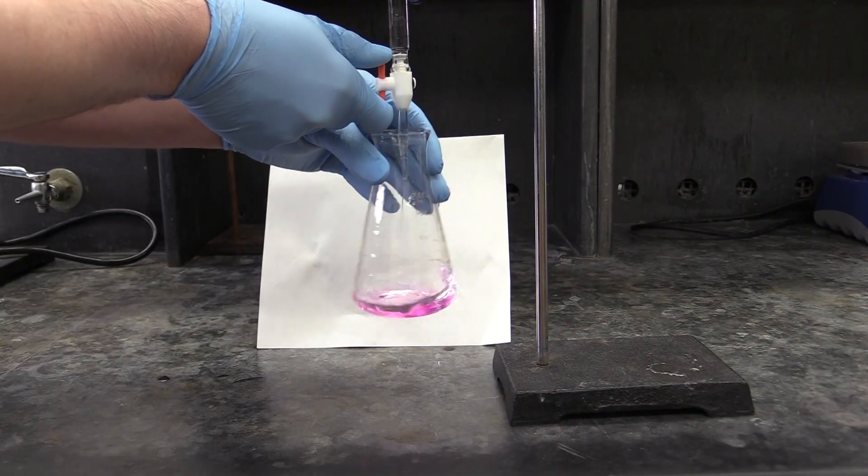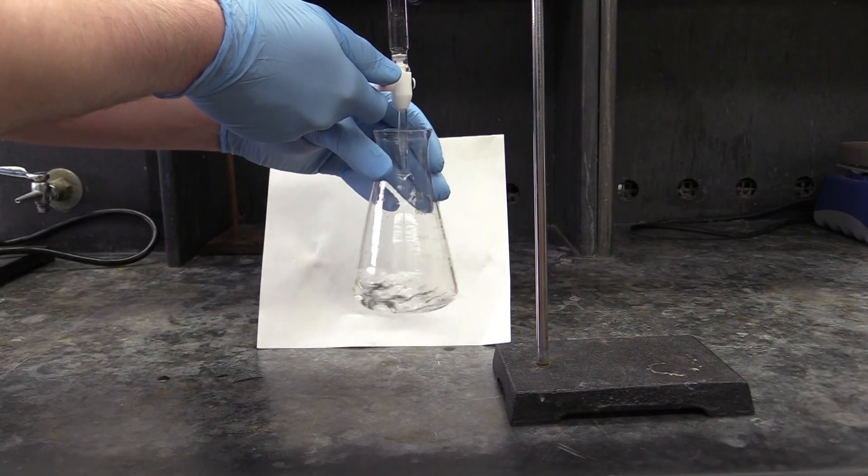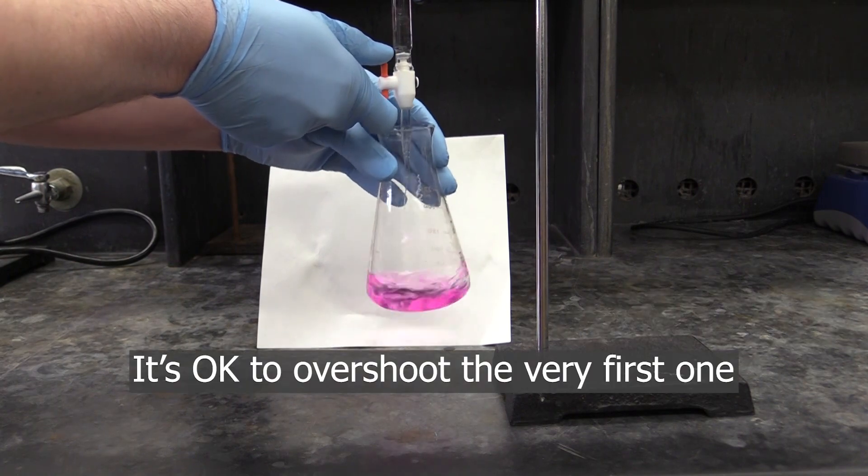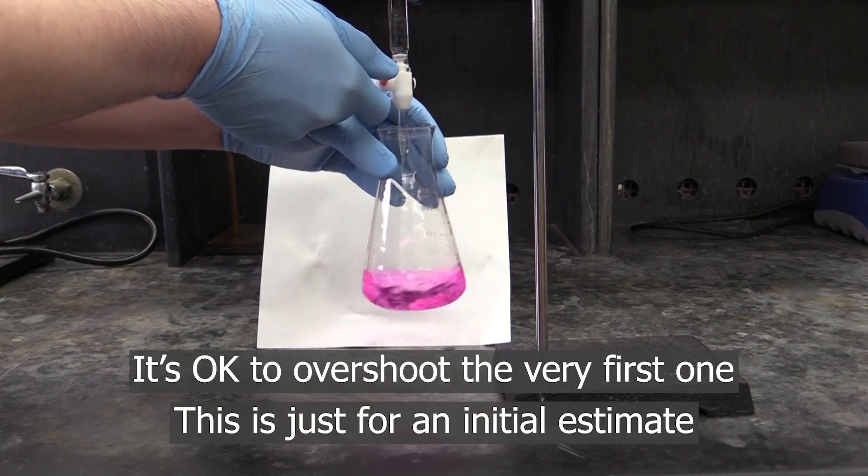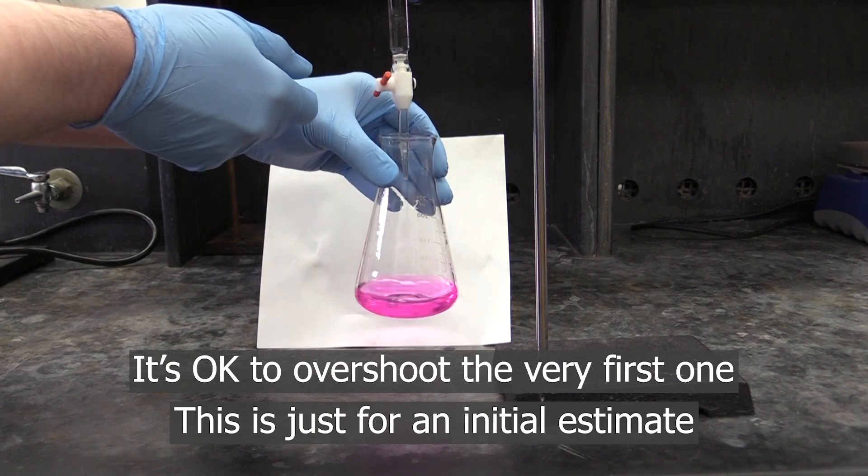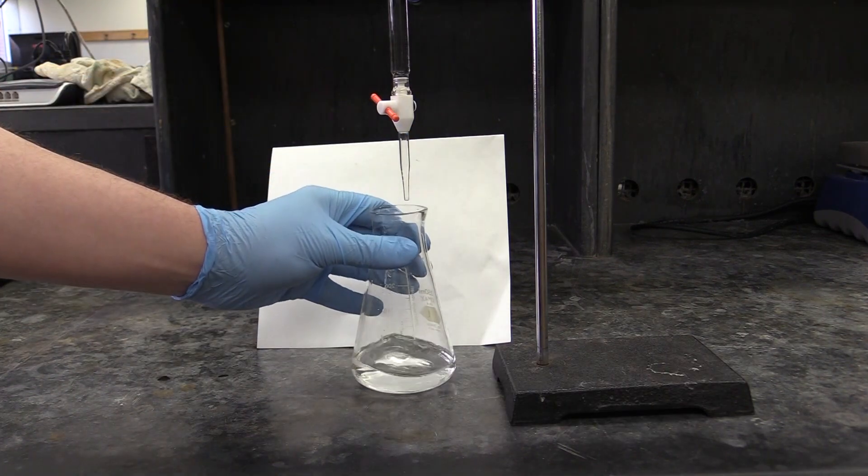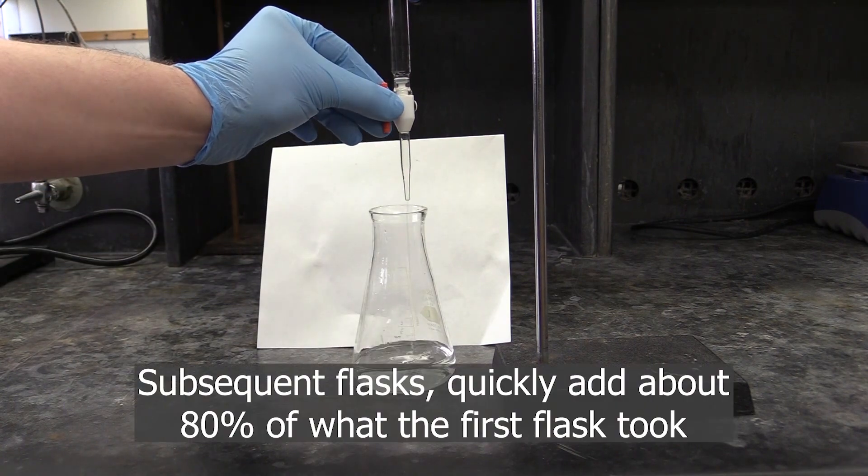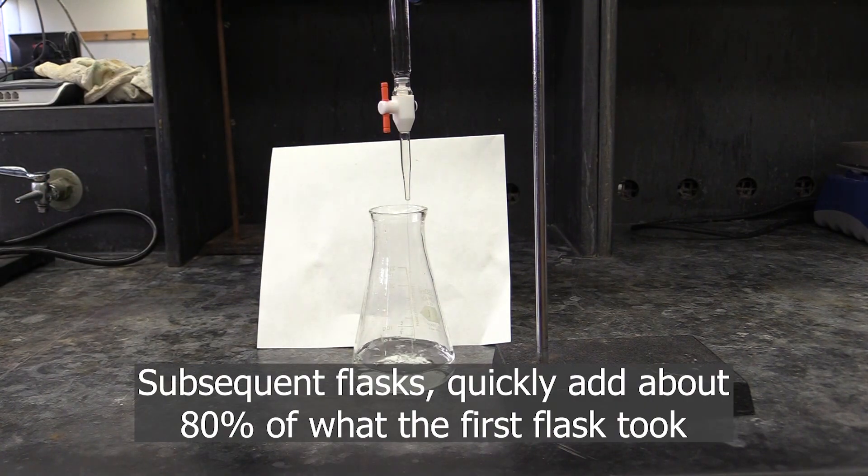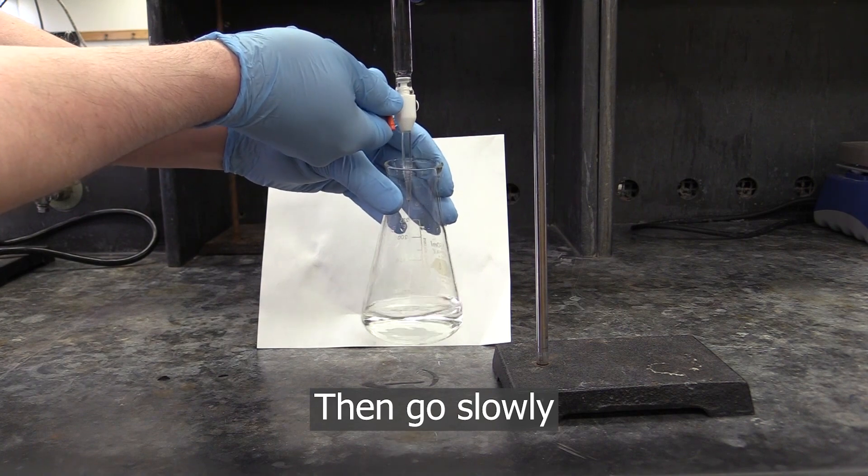Titrations can be slow, but there is one thing you can do to make this experiment go a little bit quicker. Don't try and be super careful with the first flask you titrate. Do it quickly just to give yourself a rough idea how much titrant you'll need. Once you know that, on the subsequent flasks you can crank the burette valve wide open to bring them close to the endpoint, and then go slowly and carefully from there.